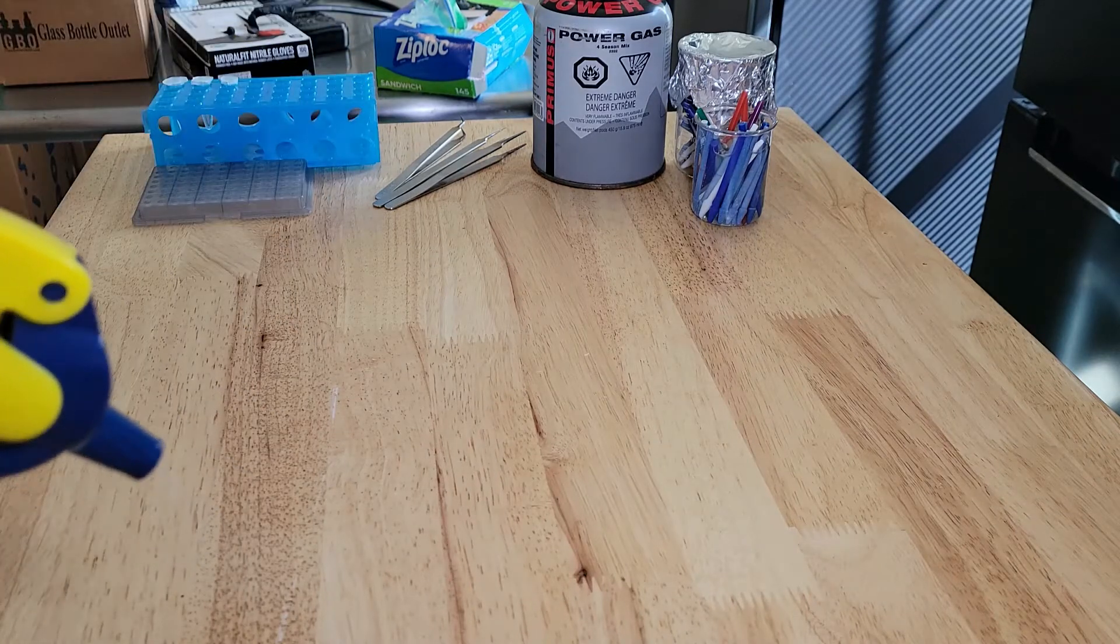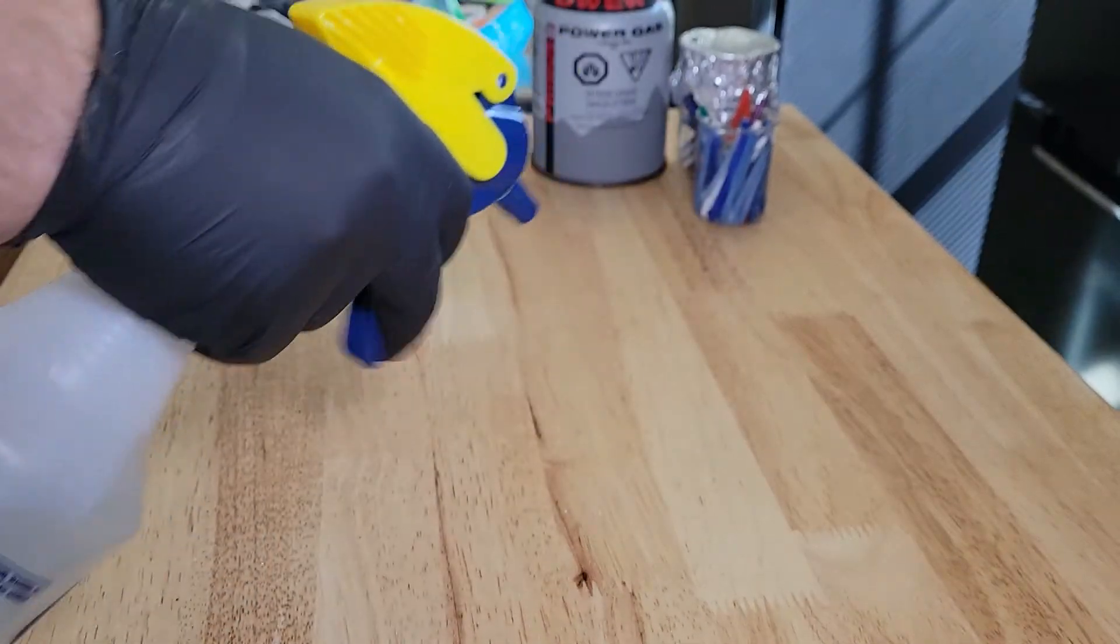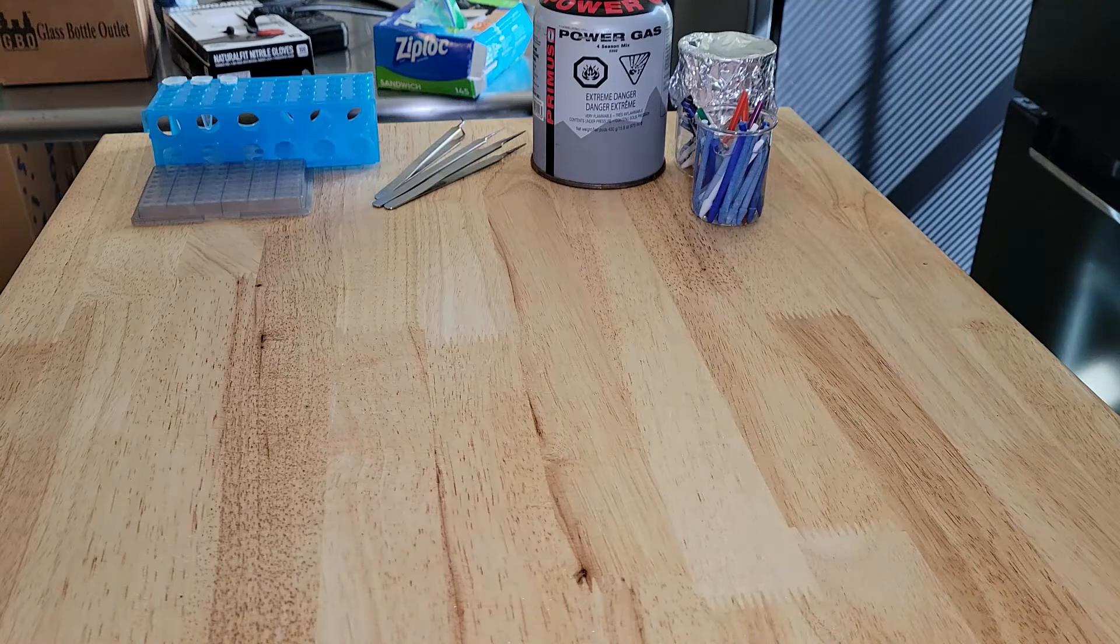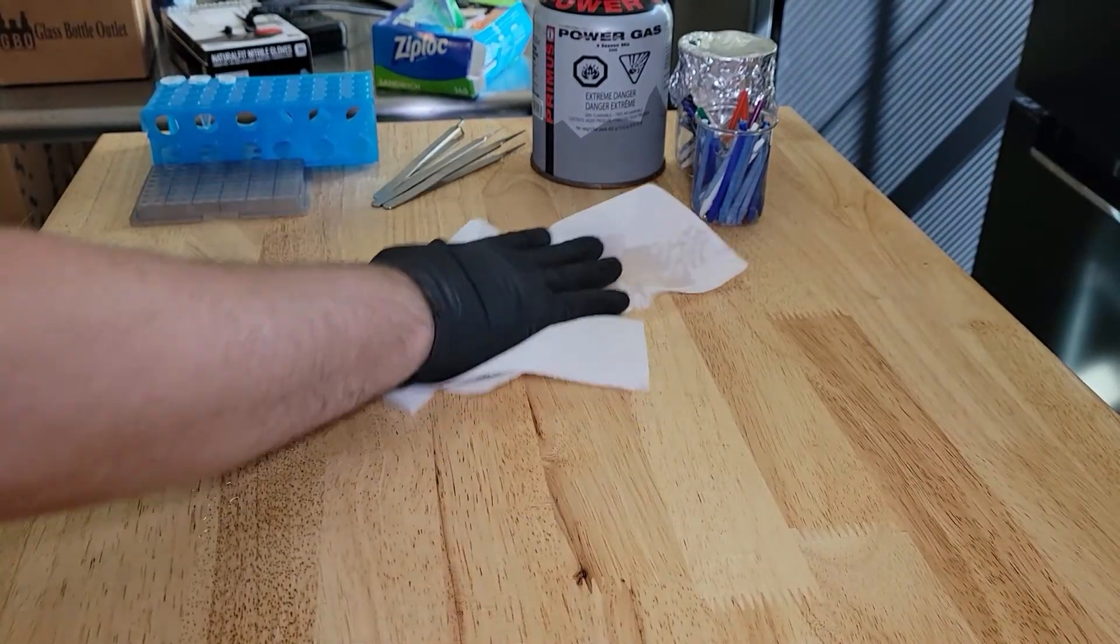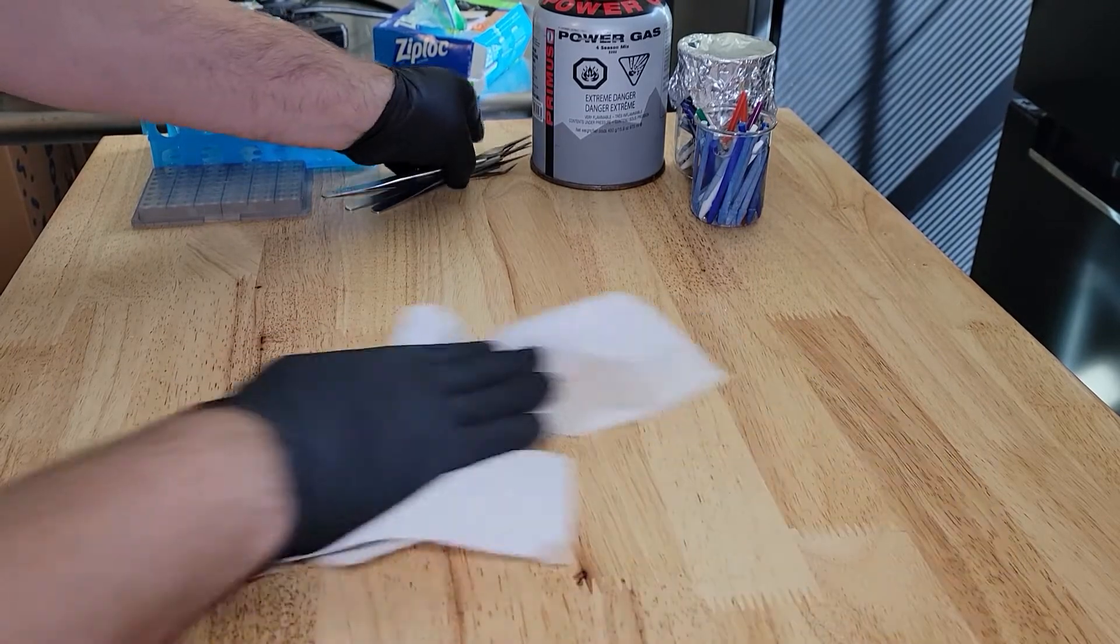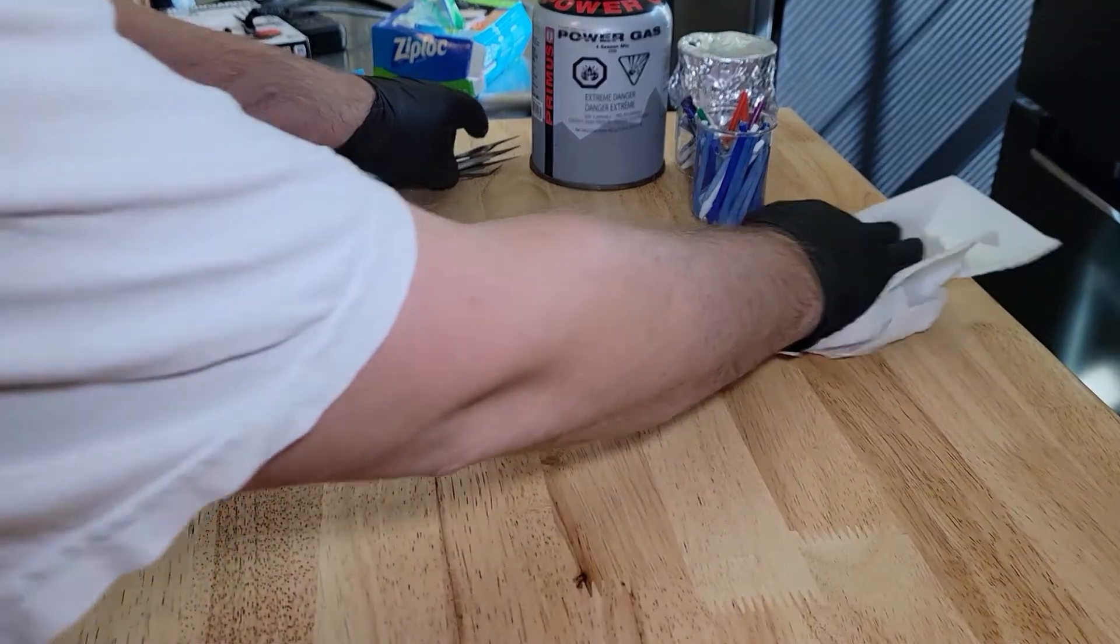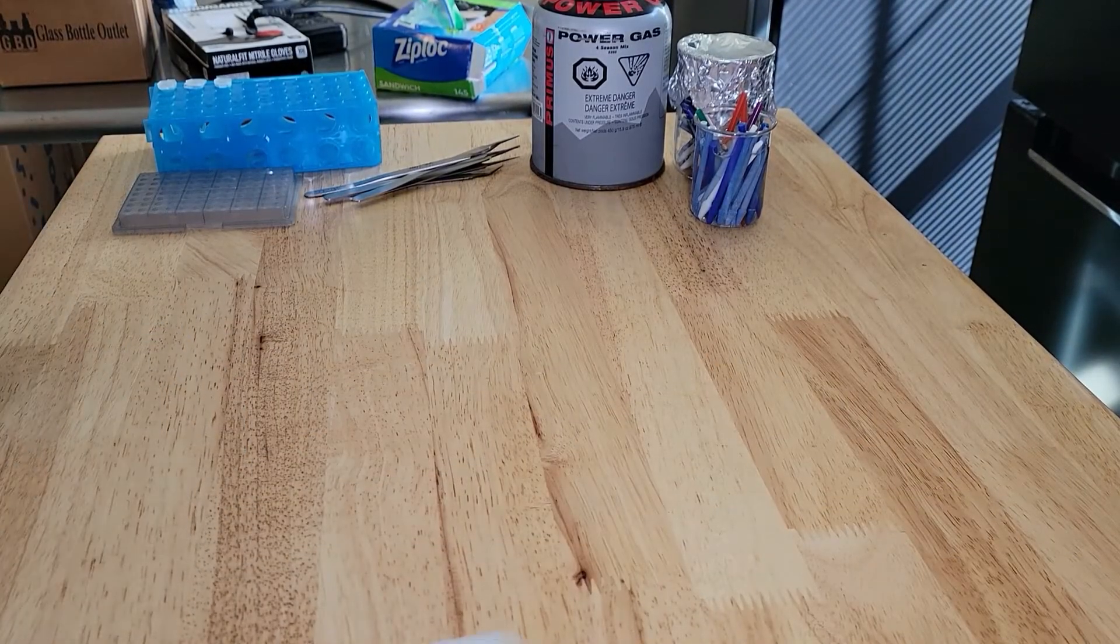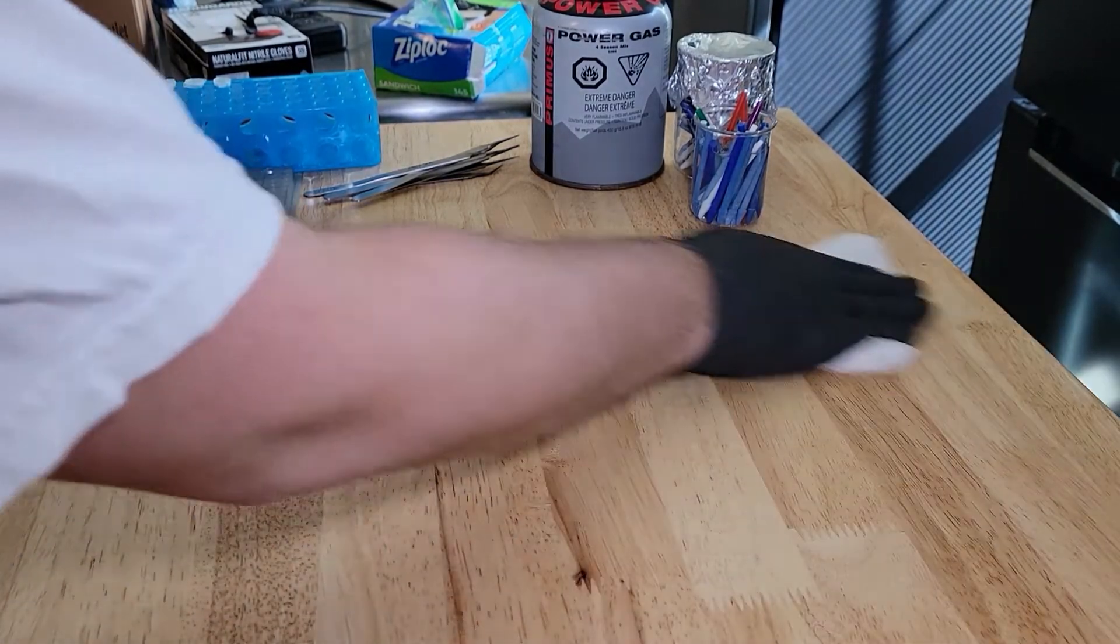Clean your work area with a 10% solution of bleach. The main purpose of this is not necessarily to disinfect, but you're going to be removing any unwanted DNA from your work surface because DNA breaks down in bleach.